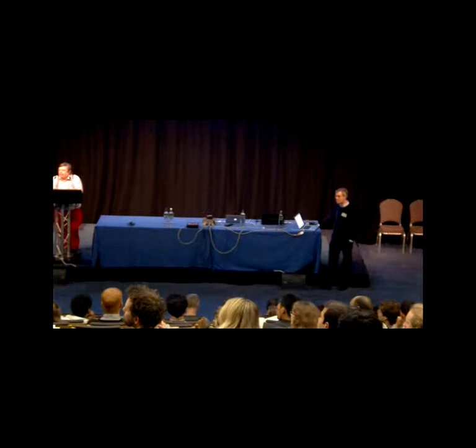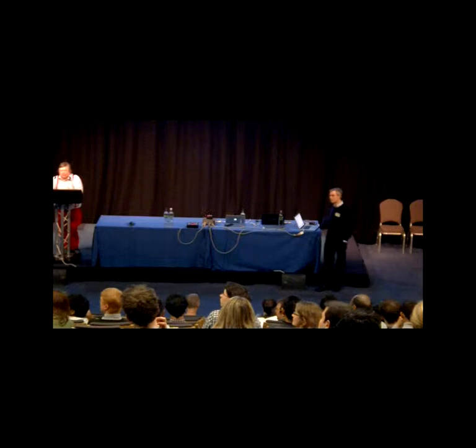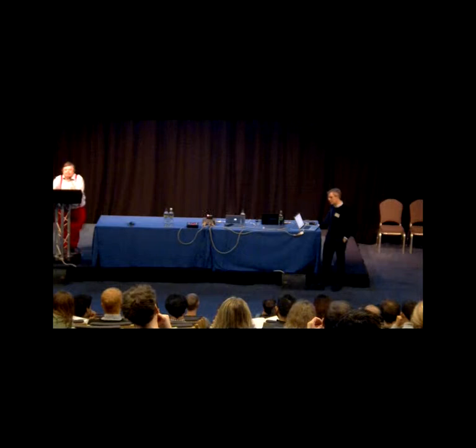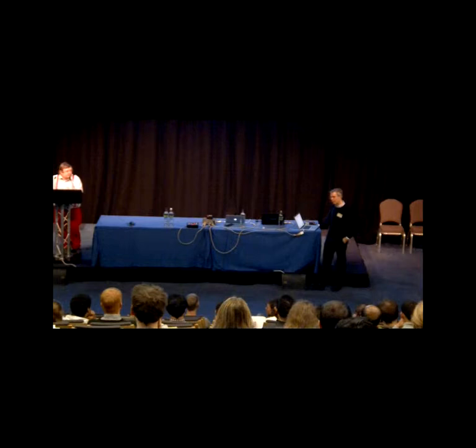I wanted to ask, you said something about size limitations as it relates to electron microscopy. What is the preferred size for quality results? It's a bit variable, but for negative stain electron microscopy, the general feeling is that anything smaller than 100,000 Dalton is too small to visualize by negative stain electron microscopy. Whereas for cryo-electron microscopy, we have much lower contrast compared to negative stain electron microscopy, so you have to have a larger size even than that. The minimum there is about 0.5 megadaltons approximately to be able to see enough features on the electron micrographs to visualize particles. Those are the rough ballpark figures.